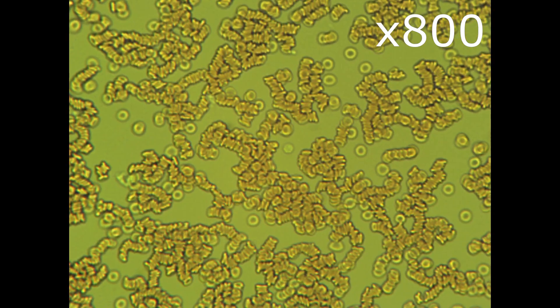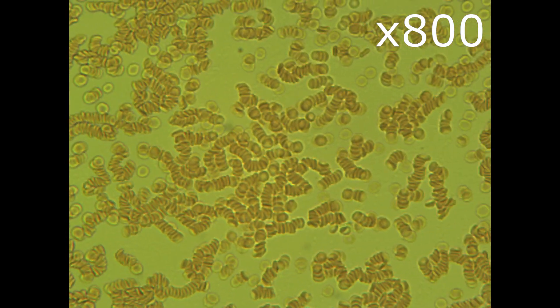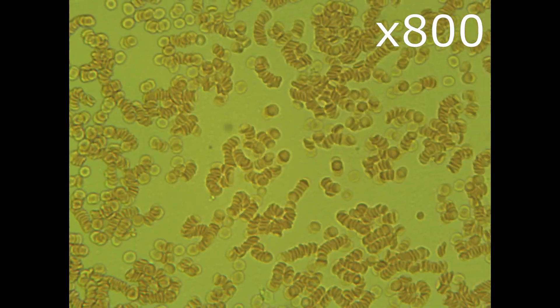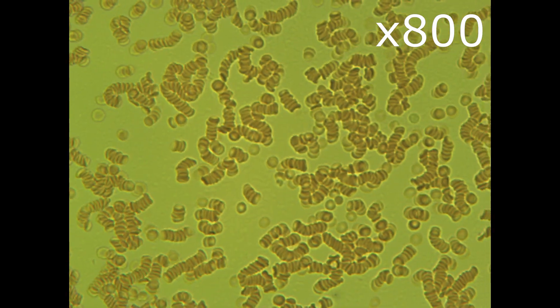Evidently the blood condition is slightly changed. It is noticeable that chains of glued erythrocytes started to form islands. Let's have a closer look zooming to 800. Indeed the length of the chains becomes slightly longer. I can also observe that they started to glue to each other forming the islands. What got my attention is there is still some space between them.